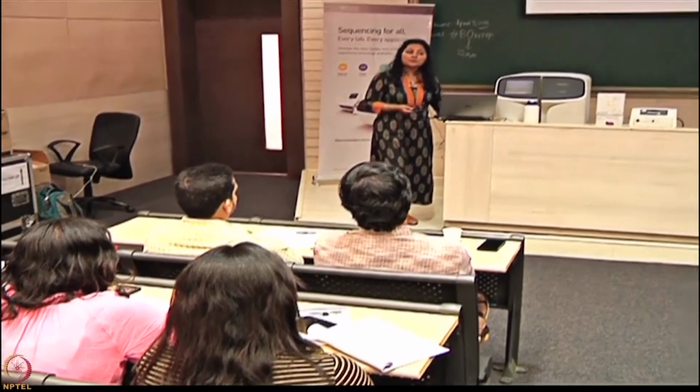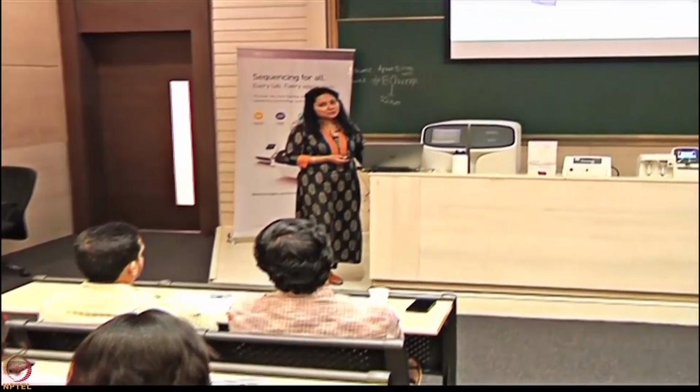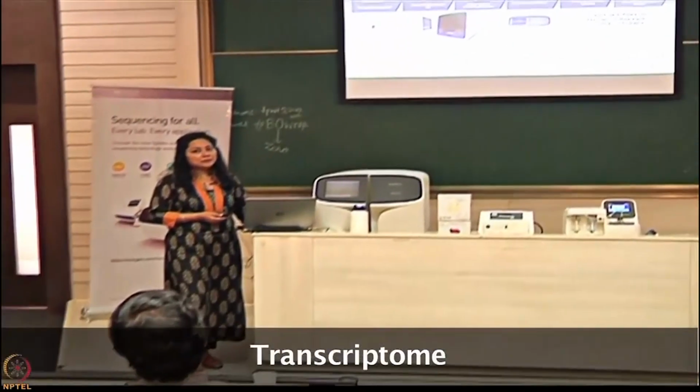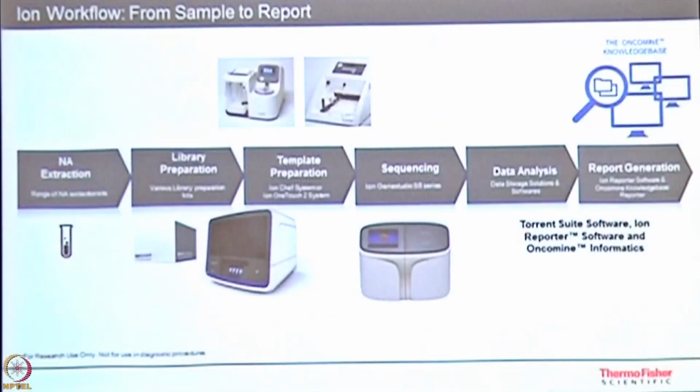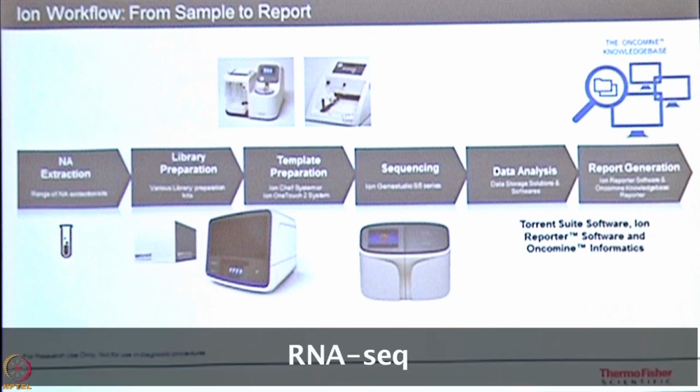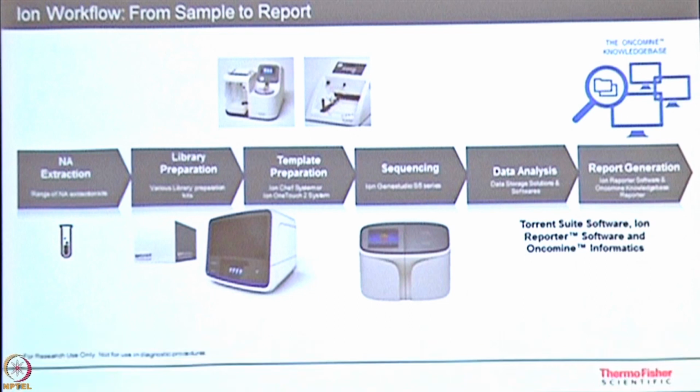Where do you think you would be using RNA as your starting material? Transcriptomes, yes. Again, you are looking at some targeted transcripts, or at some targeted fusion events. Anything else? RNA-seq, yes. And typically, why would you do an RNA-seq?